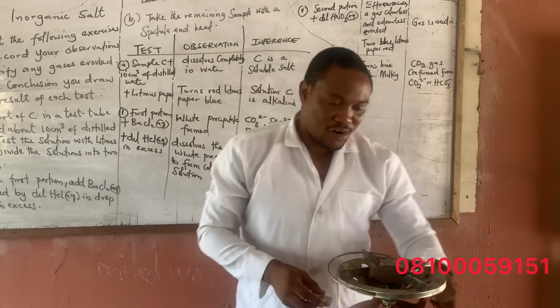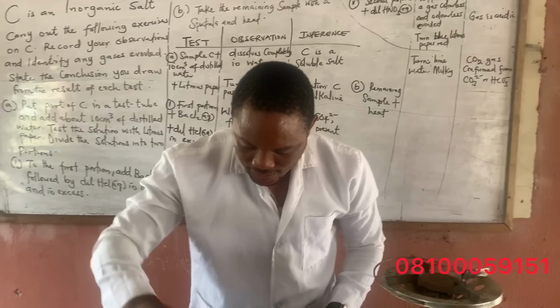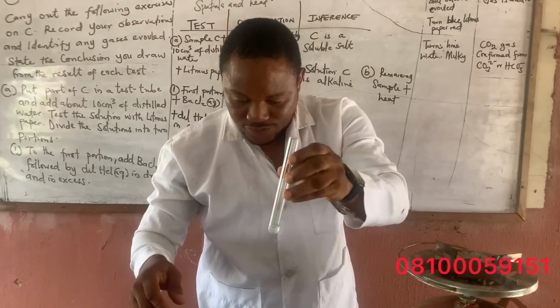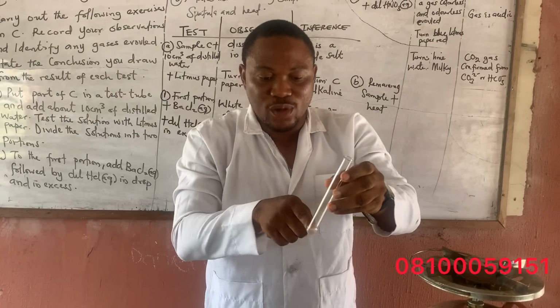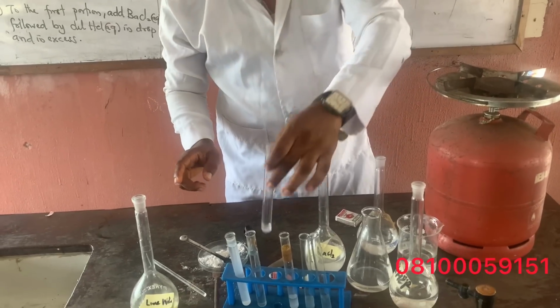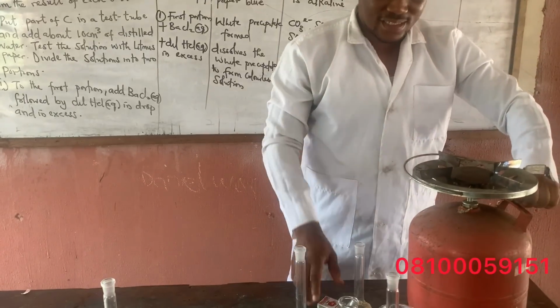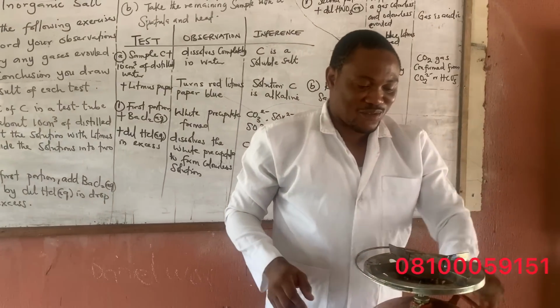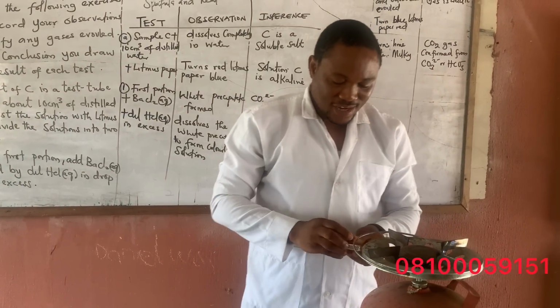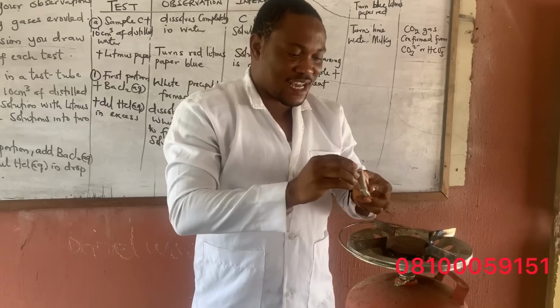This is part of the portion I dissolved. I will use the liquid, and also the dry salt, so you can see that we are still going to get the same result. Flame test is another interesting aspect of qualitative analysis. So let me light this up.